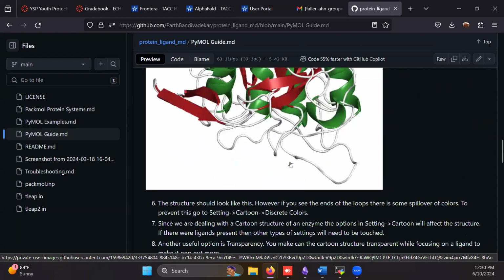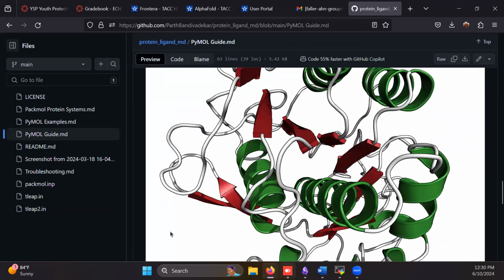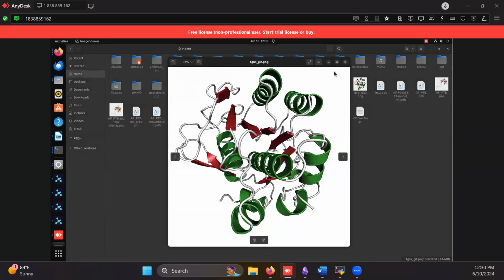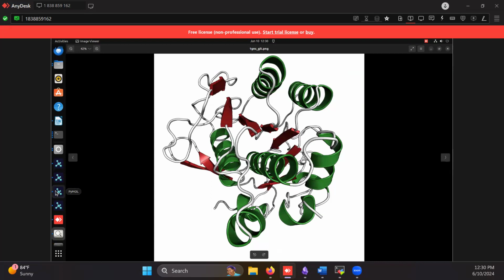This is where the perspective view comes in. I'll show this better here. This is a perspective view set at 70 field of view. This is clearly showing where all the alpha helices are with respect to each other, how the beta sheets align. And this is where I said, hey, sometimes you need to change the view to be perspective instead of orthoscopic, because you can get these more stylized, cool images to show the structure much better.